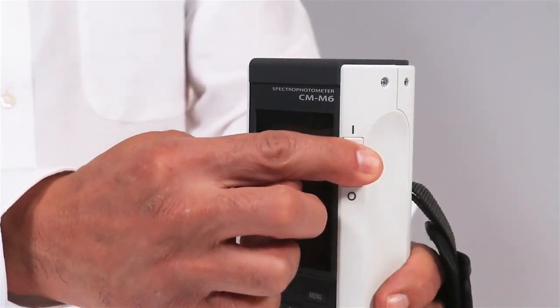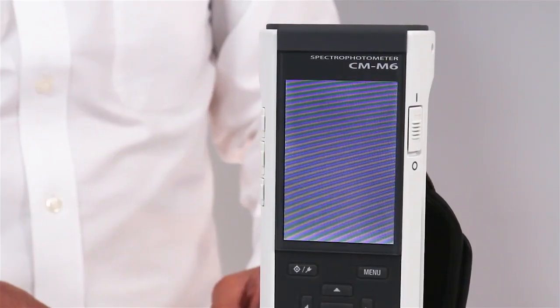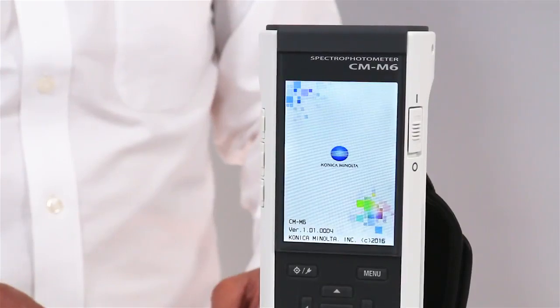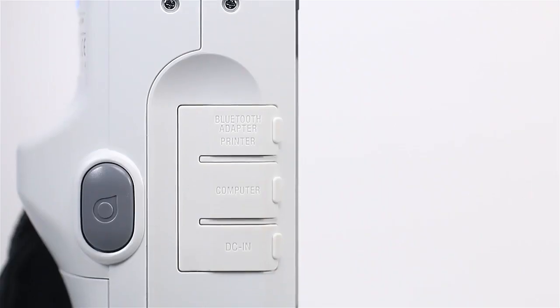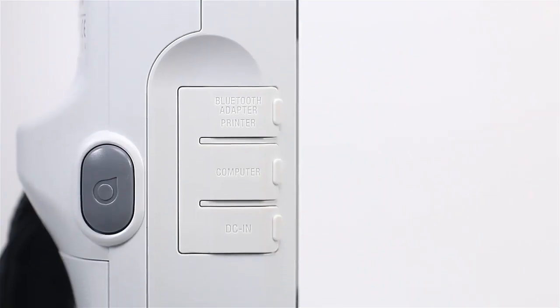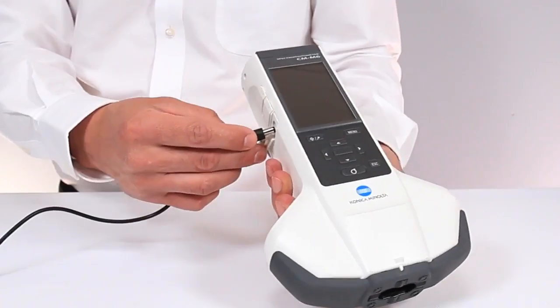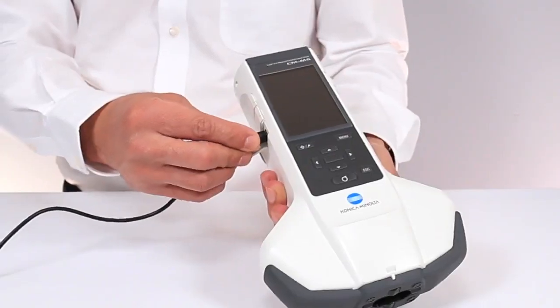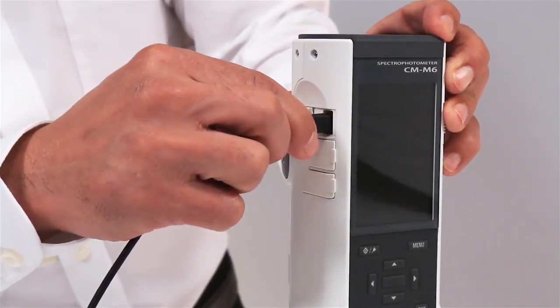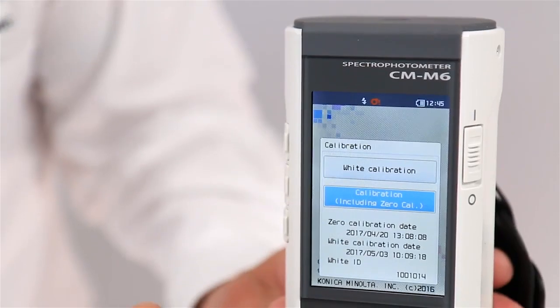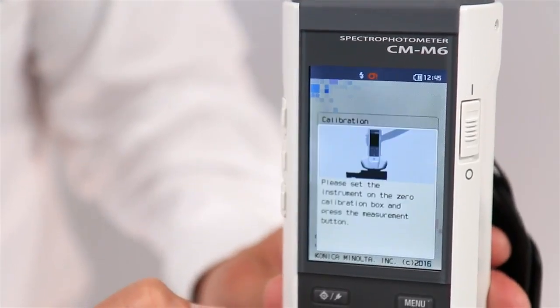To begin measurement, power the CM-M6 with a rechargeable battery, AC adapter, or a USB cable. Then perform a zero and white calibration.